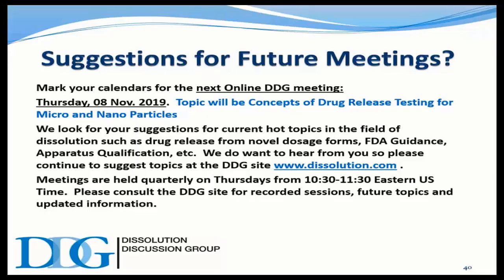Our next topic for our meeting is on micro and nanoparticles. It may not be for everyone, but as we develop methods for dissolution and drug release, new products come along every day, and this is getting to be a much more common delivery, maybe injectables and things that use some of these micro and nanospheres that require dissolution. And thinking through these is what we're going to do in our next meeting.